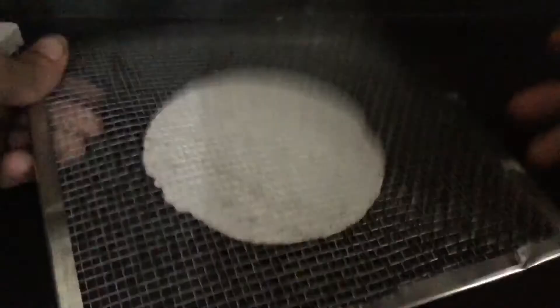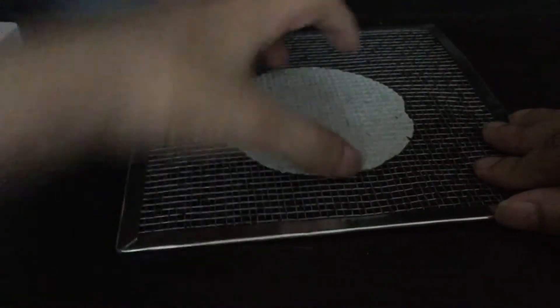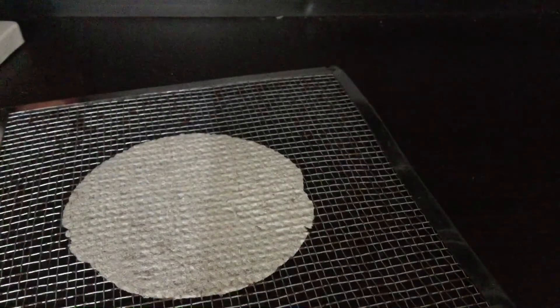Now the second item is asbestos wire mesh. You have to keep it on the stand, which I'll show you now. This is the wire mesh with the asbestos. Third item is a tripod stand. The asbestos mesh should be kept above the tripod stand like this, and you can place any vessel on top.